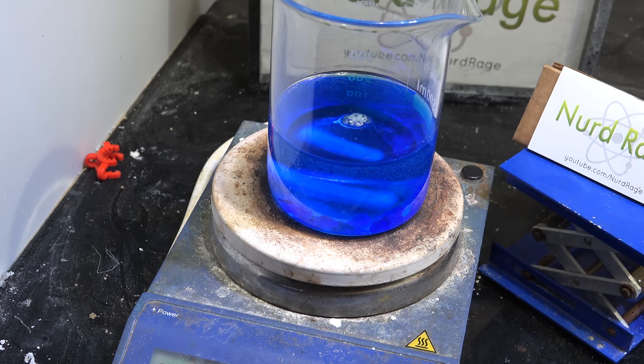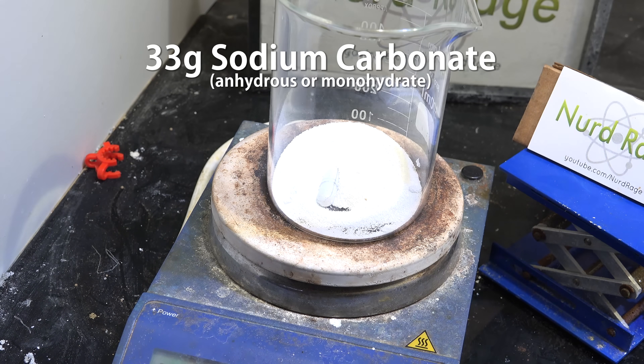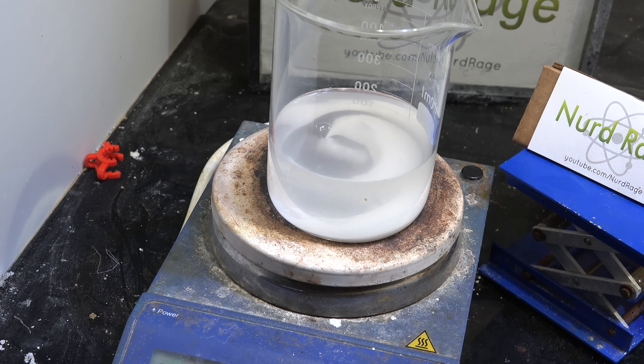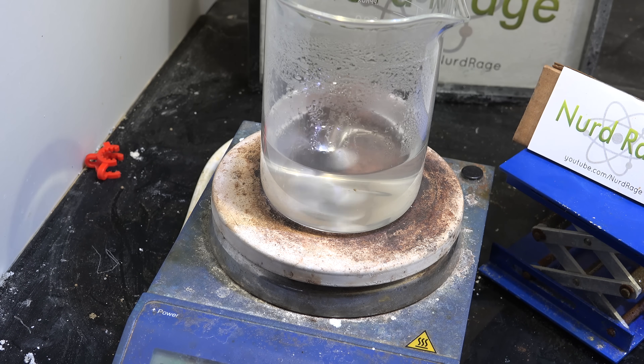This is going to take a while. Now in a separate container we get 33g of sodium carbonate. To this we add 150mL of water and stir until dissolved. You can also use sodium bicarbonate if you adjust the stoichiometry, but I prefer sodium carbonate for this since it dissolves more than sodium bicarbonate.